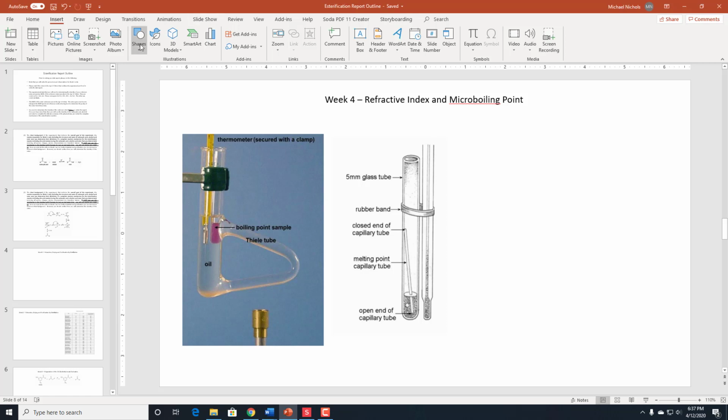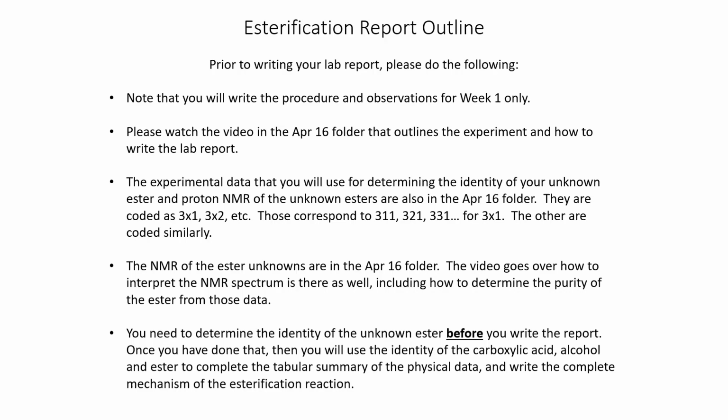Okay, this is the video to help you analyze your Ester results. I'm going to explain what we would have done had we done weeks 2, 3, and 4, and I'm going to go over the lab report form that you're going to turn in for this experiment.